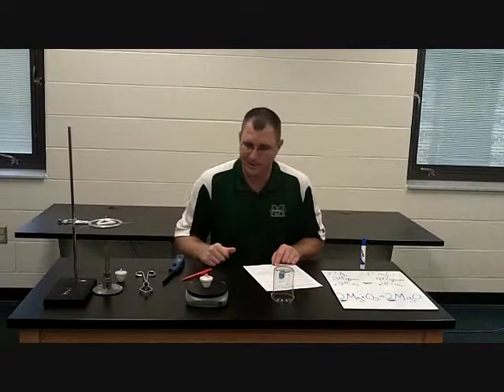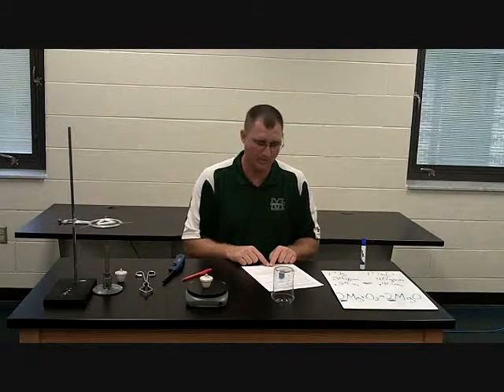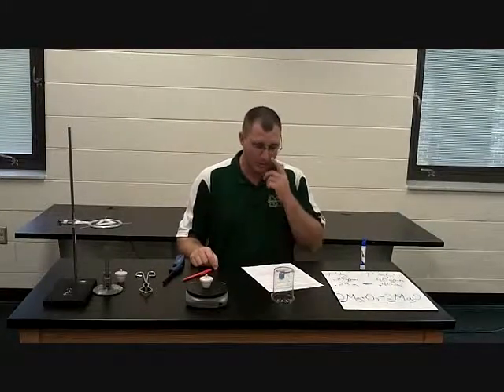So I put it on there, and the funny thing that happens is now it weighs 20.00 grams. So it actually gained weight. It gained 0.16 grams, and nobody understands that because they burned it, right? There's less of it. So let's look back and do some of the math.